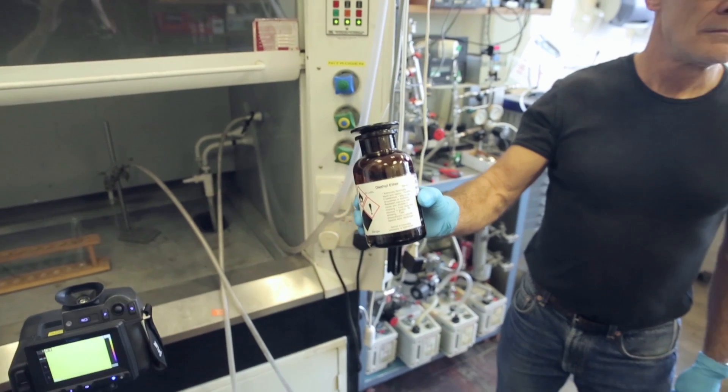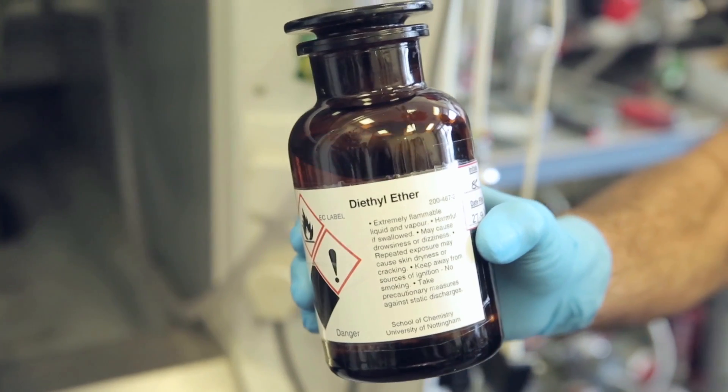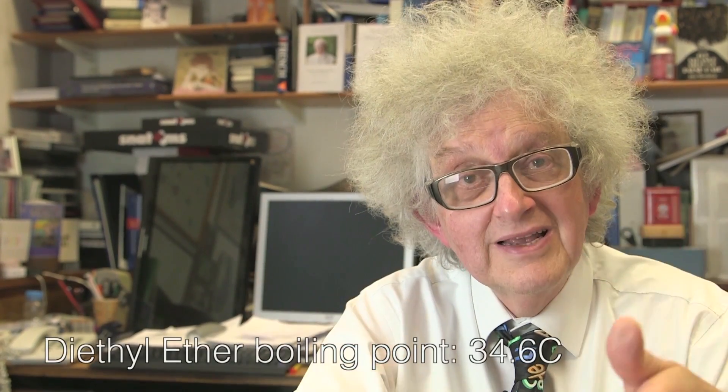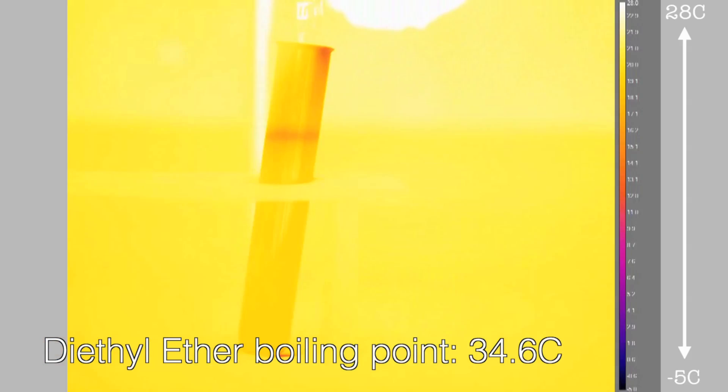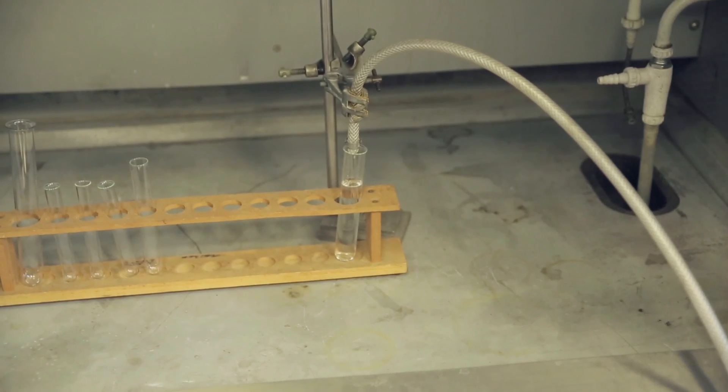It consists of a test tube in a test tube rack filled nearly to the top with diethyl ether. The point about diethyl ether is that it's very volatile. Its boiling point is just above room temperature, and so you can get it to evaporate by blowing air through it, but it's better to use nitrogen because it's pretty inflammable.